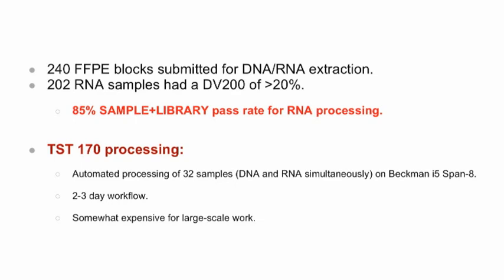Beckman did all of that development, and we've been incorporating it. The reason we wanted this particular prep to be fully canned was so that we could have fast turnaround time, multiple shifts of technicians being able to do it, and have it run exactly the same way every time, no matter who was doing it. So that's why this was done that way.